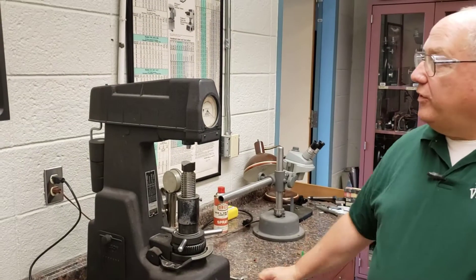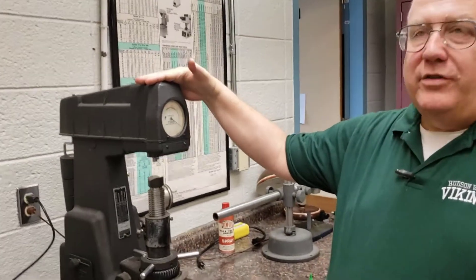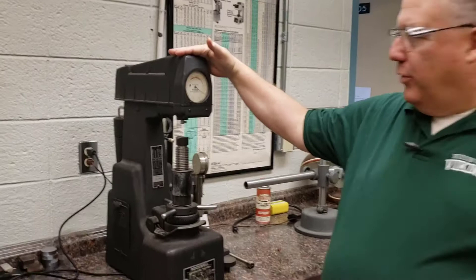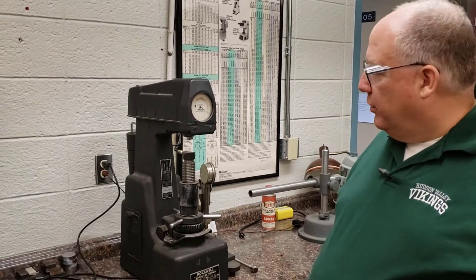This is a manual Rockwell tester. It's nice to show how those work. They're old-fashioned, but a lot of companies still use them.